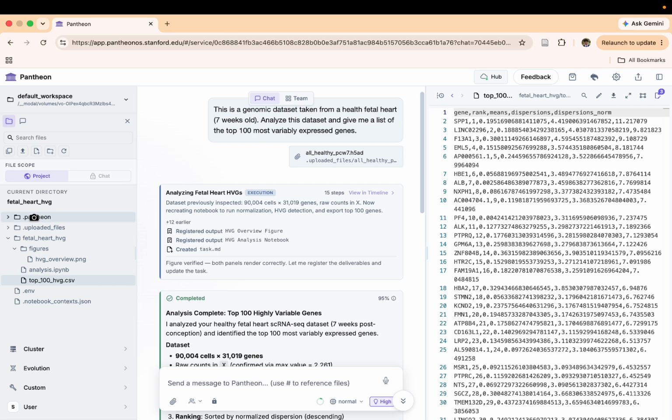But it's always easier to specify in the prompt itself. And then you want spatial transcriptomic analysis and any specifications of what exactly you want, specific workflows that you want. Yeah, very open-ended, and it will give you rigorous results.